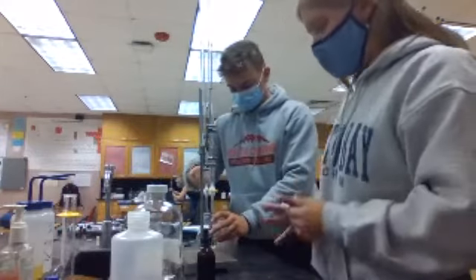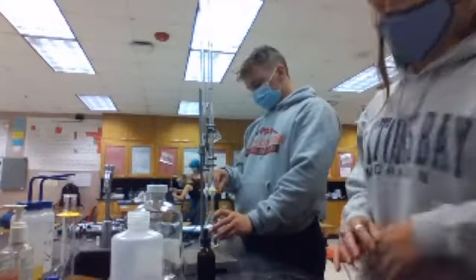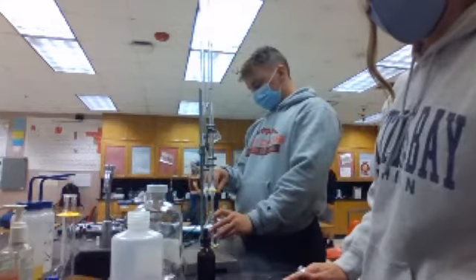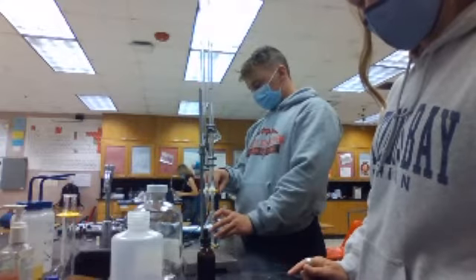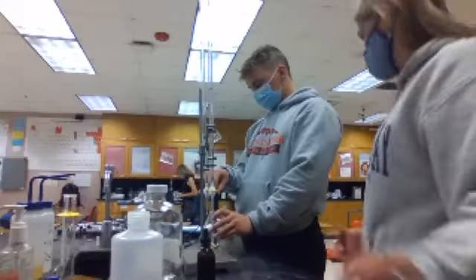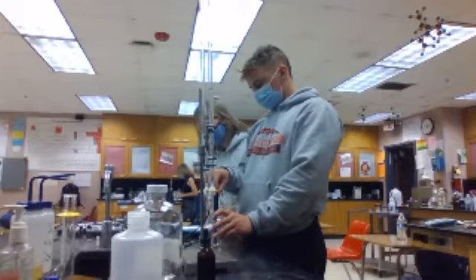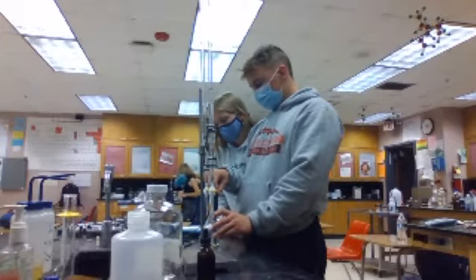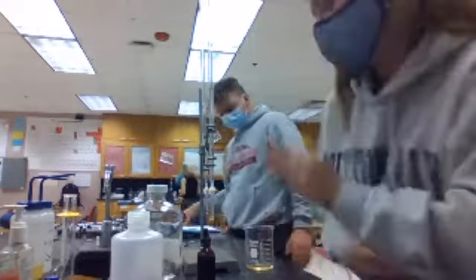Yeah, so how many milliliters is it usually for this? Because we don't have to wait too long. Well, you can take the pH of it and see, right? You know the volume. But you're gonna take 10 milliliters of this acid still. It was like 9.5. Yep. Yeah, that's the acetic acid. Okay. For 1 milliliter, it's 1.09. Okay, number 2.